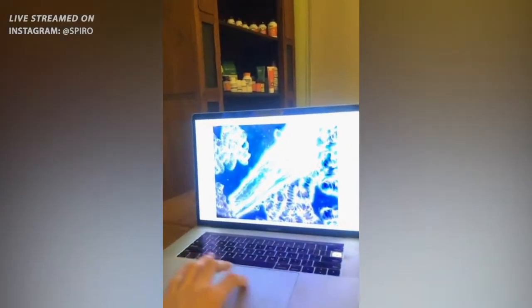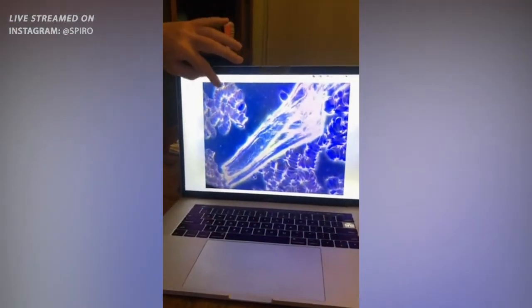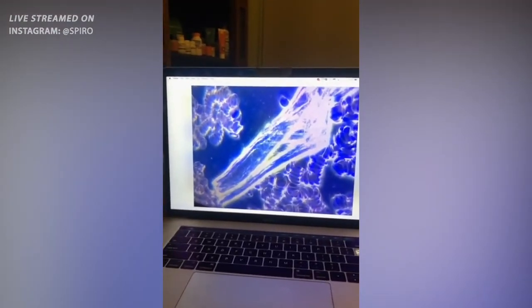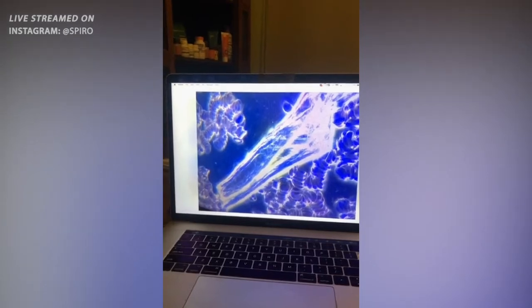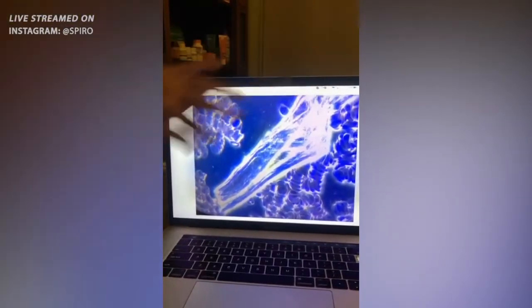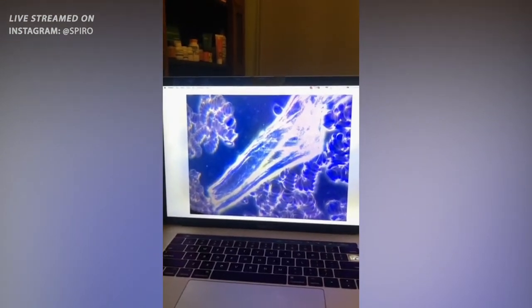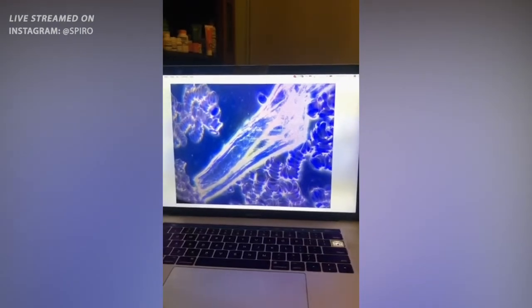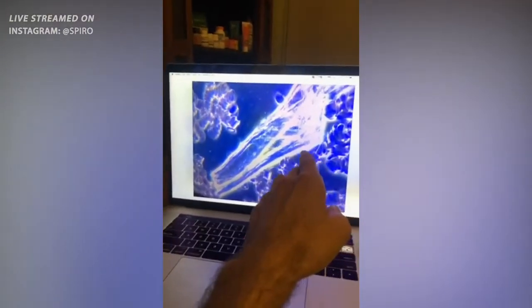What's this? So what we see here is that the red blood cells are all stuck on each other, stuck like pancakes, we could say. It's a coagulation problem. And we also see this big thing here in the blood, which I cannot explain exactly, because I cannot analyze it deeper with my equipment, but I can assume it's graphene oxide or something.